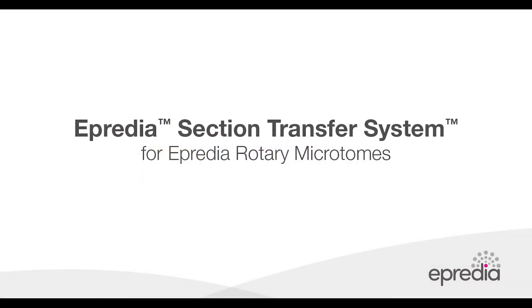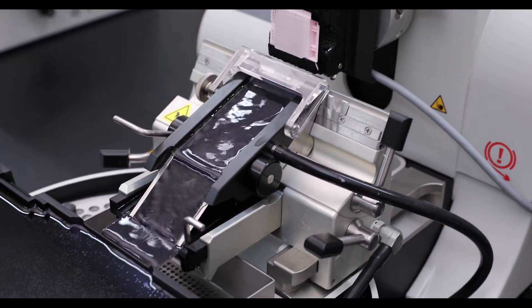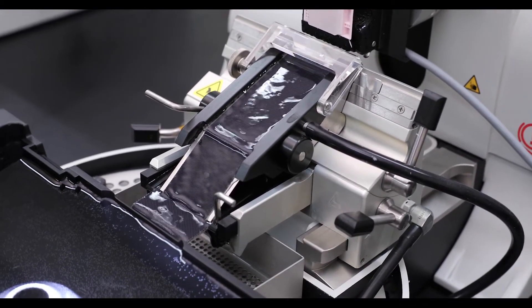Do you want to be able to get high quality and highly reproducible sections? Then the section transfer system from Epredia is a great accessory for your Epredia Microtome.